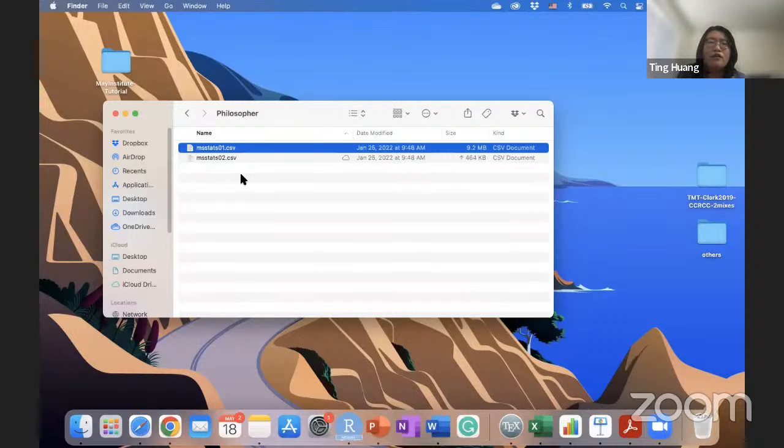What is more interesting here is why it's called MSstats CSV, because we now collaborate with FragPipe. As Mina mentioned yesterday, for MSstats and MSstatsTMT, the whole package family, we require a certain format of the input. Different tools like PD, MaxQuant, OpenMS, or here FragPipe, have different output formats. Even for the same type of data, like PSM level data or peptide level data, they all have different formats and different column names.